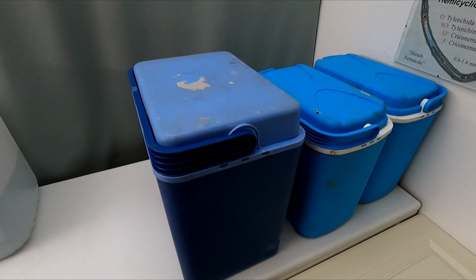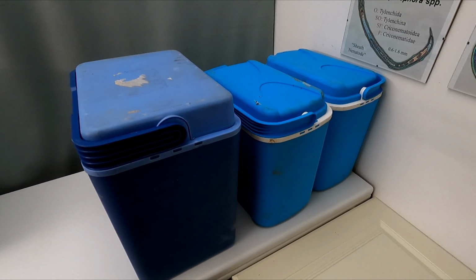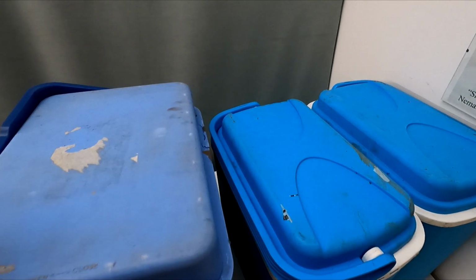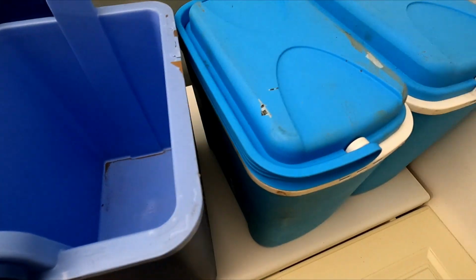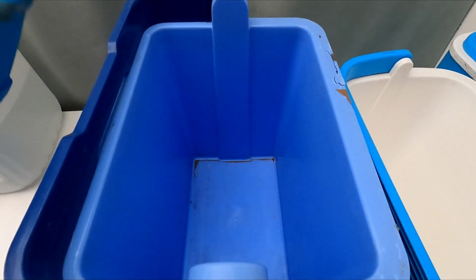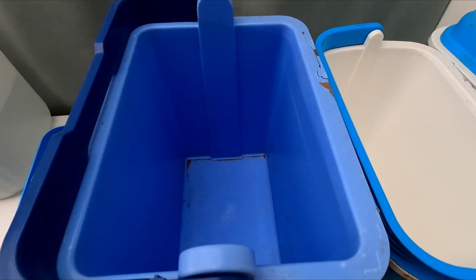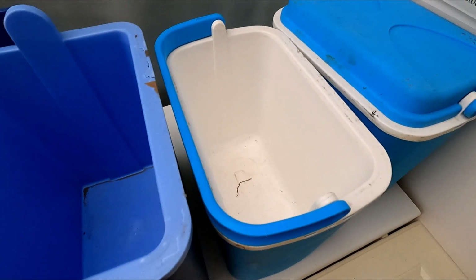One of the key items that I use to do this is a picnic cool box. We're talking about these kind of things with a plastic handle and a lid that pops off. You can look inside, it's quite a thick plastic, that's because it has an insulated cavity within it. And they come in all different shapes and sizes, there's a few here. If you are going to use your picnic cool box for soil, then I do strongly suggest that you clean it down after use before you put your sandwiches back in it.